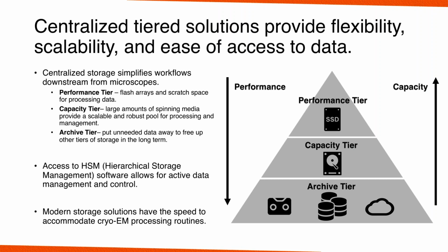The final big benefit to all of this is that when you have this pyramid of tiered storage running, you've got your scratch, you've got all your spinning media holding all of your images for processing, and you've got your archival tiers. You have access to a new breed of software called hierarchical storage management software that allows you to really control and manipulate the data in a way that is really helpful if you're managing a facility, because you can see which users are using the most data, you can see how old the data is, you can actively move data between tiers, you can handle archival. It's really helpful, and these are things that we can talk about later as well.